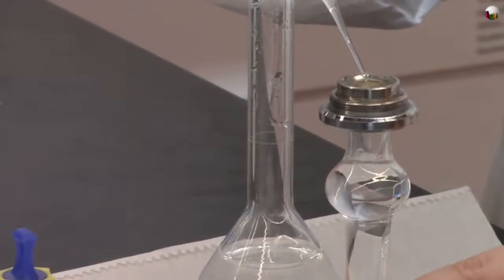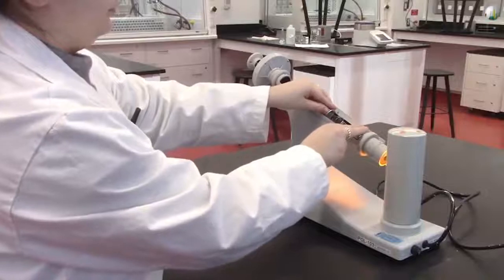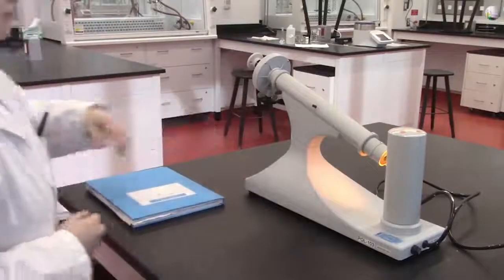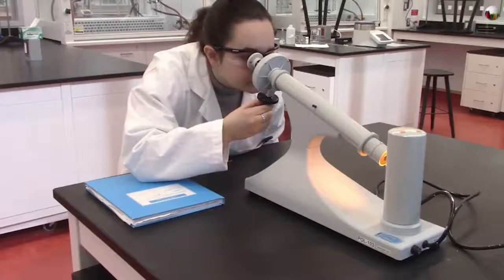Next, after discarding the deionized water, fill the sample holder with the solution of the sample. Place the sample holder in the polarimeter. As done before, adjust the dial to see the two semicircular halves with equal brightness. Now note the value of rotation, using first the outer dial.